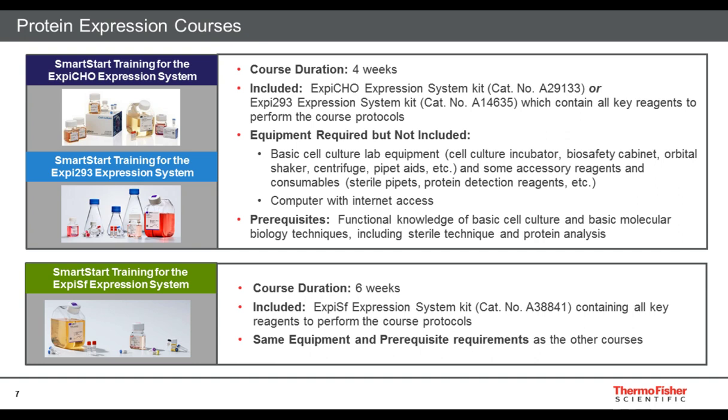In both of these cases, too, you'll note if you're really working on your own, working with these products would actually probably go a little bit faster. So we've added a little bit of time at some of the key workflow steps to make sure that if something goes wrong, you have some time to do another run of get another cell culture started or do another run of the experiment. So we try to build in a little bit of buffer time in case you need a little extra time to redo one of the key steps.